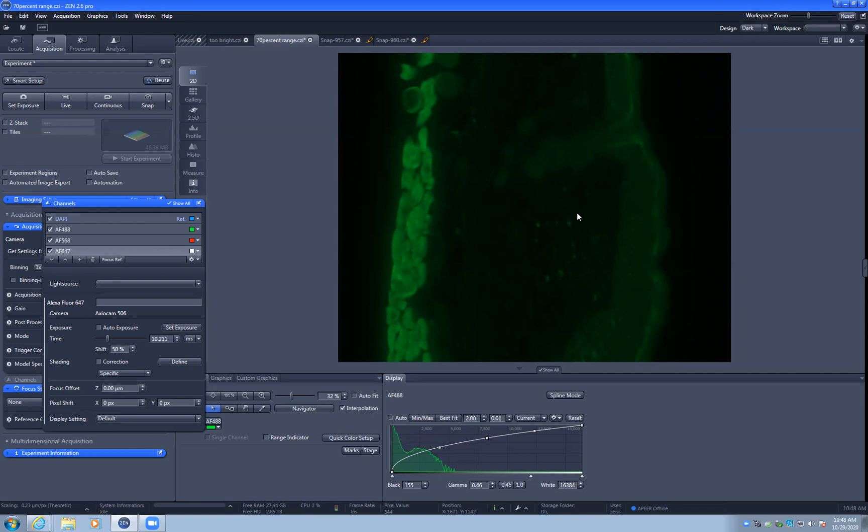Now, if the raw data was saturated, this would not be possible. So let's talk about how to actually set up the exposure to take these pictures.